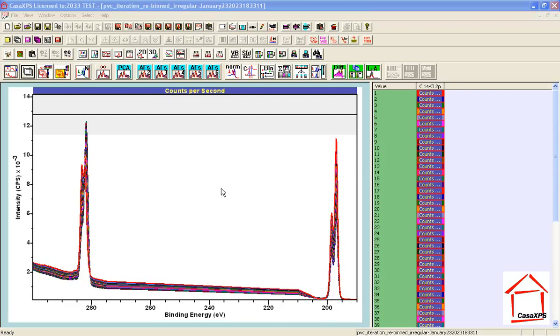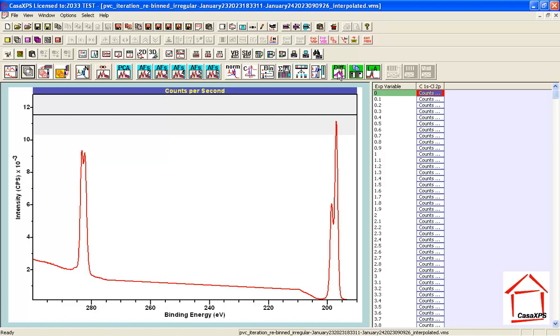And this happens sufficiently often that when I overlay data in the active tile and view the data, the difference that I want to calculate is from the first and the last. And that's what this difference toolbar button does. It performs a difference calculation that is based on the first and the last that was selected out of the data that are displayed in the active tile. So when I press this, the toolbar button converts the set of spectra, taking the first and the last, into a list that corresponds to the difference between the first and the last, with incremental changes in the magnitude of the first and the last in that difference. So when I scan down this list, I can see what happens to the data.